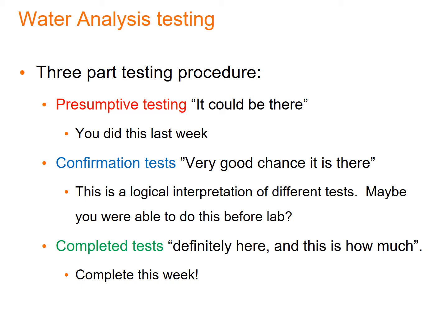From that, then, we can move on to the completed tests, the proverbial nail in the coffin, the tests that say that there is definitely E. coli present here. And not only is it here, but I know exactly how much. And that is what we're going to complete this week. We will finish up the confirmation tests and we'll move on to the completed tests.